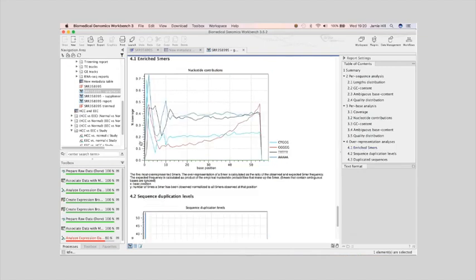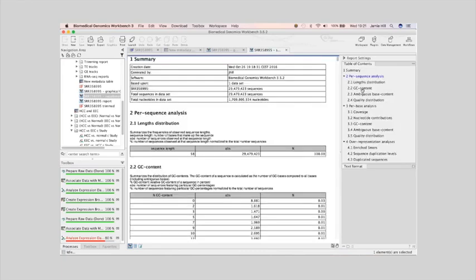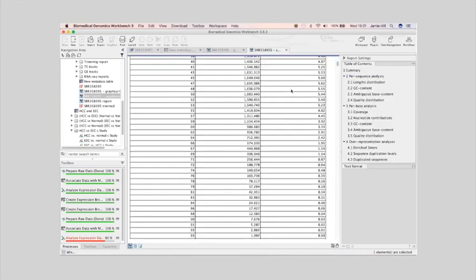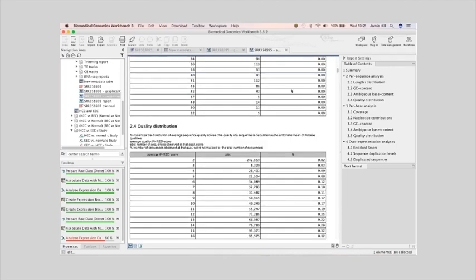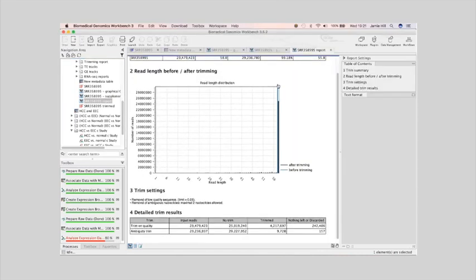The enriched 5-mers, which, as I said, are only about 0.7%. That's not too worrying. And then the duplicated sequences plot. I get a supplementary report out as well, which contains a lot of details that you can parse out. And I get a trimming report showing what was trimmed. So you can see that after the trimming, I get a distribution of lengths. Before the trimming, everything's 58 long, and most things remain untrimmed, it seems.